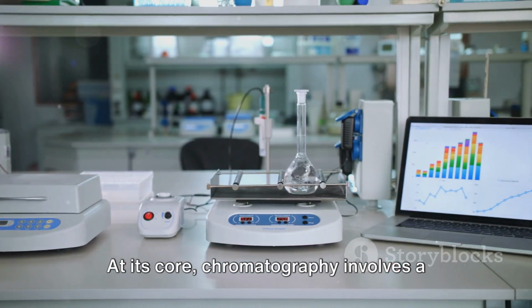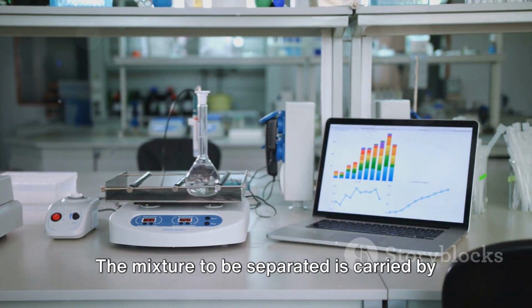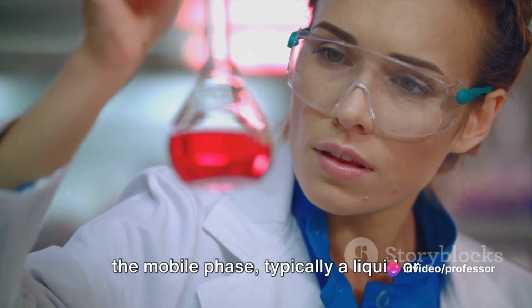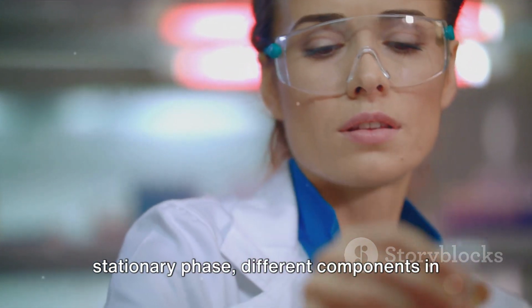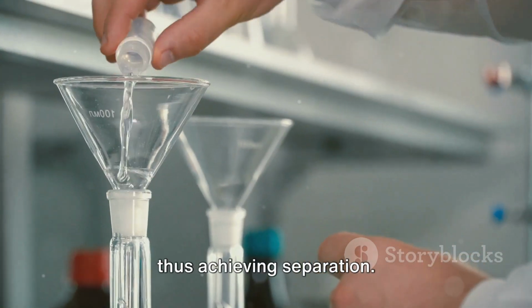At its core, chromatography involves a stationary phase and a mobile phase. The mixture to be separated is carried by the mobile phase, typically a liquid or gas, over the stationary phase. Depending on their affinity for the stationary phase, different components in the mixture travel at different speeds, thus achieving separation.